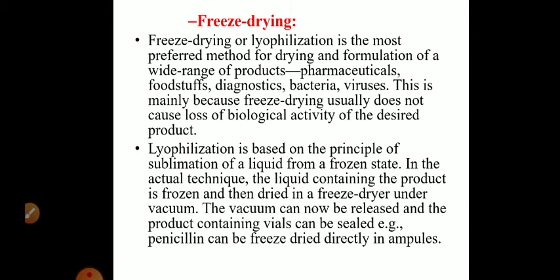Freeze drying. Freeze drying is also called lyophilization. In the case of lyophilization, this is the preferred method if you want to dry your microorganisms, vaccines, heat sensitive material, viruses. Bacterial cultures can be freeze dried. It is the most preferred method for a wide range of products like pharmaceutical products, certain foodstuffs, diagnostics, bacteria, viruses, vaccines, etc.